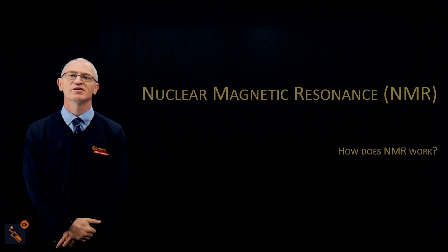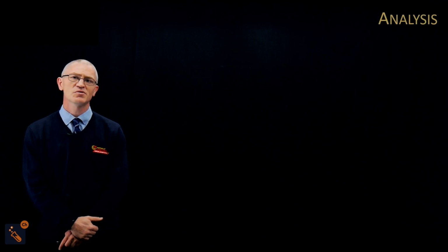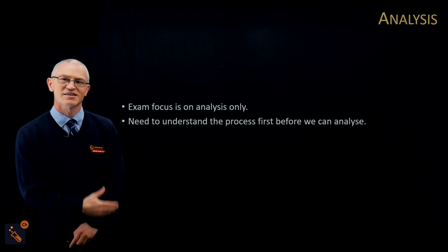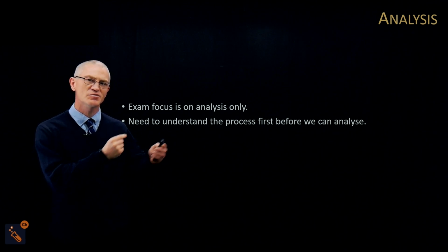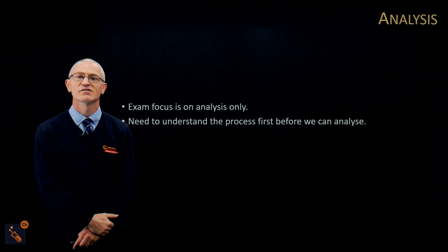In this video, we're going to talk about nuclear magnetic resonance, NMR, and how it works, and go through a couple of exam-style questions that you'll need to know. But the important thing is that nuclear magnetic resonance is basically analysis only for exams. So we look at the analysis of it, but first of all, we need to understand the process. So I'm going to get you in this video to understand the process.